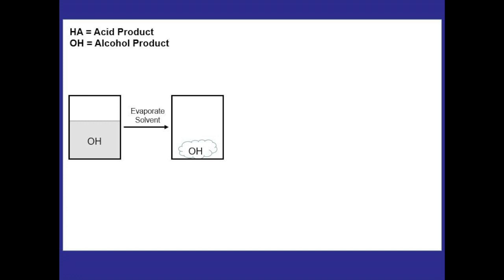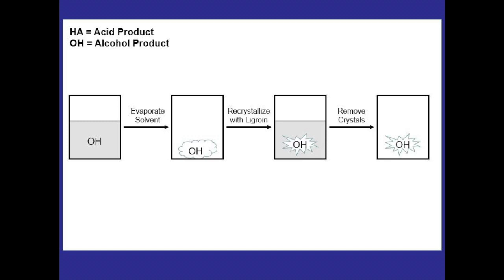And then for purification, we'll recrystallize that product using ligroin and then remove the crystals, and we can then characterize those crystals by taking a melting point and running an IR spec.